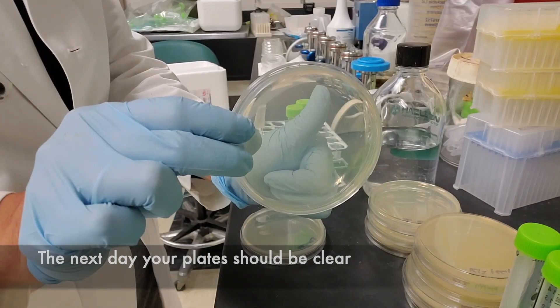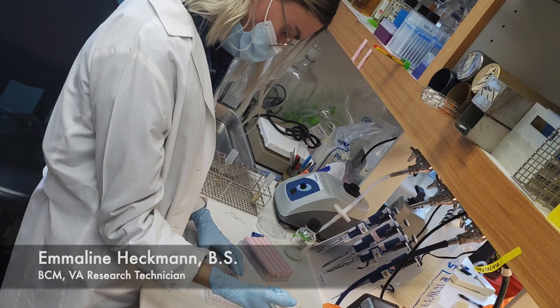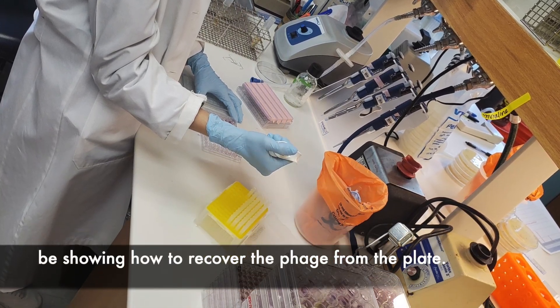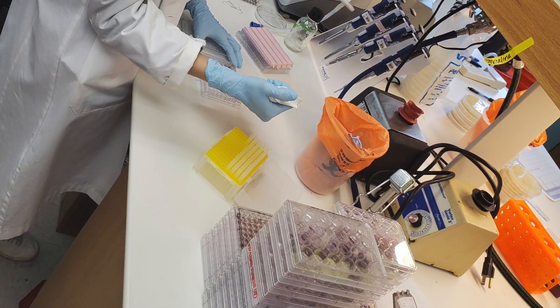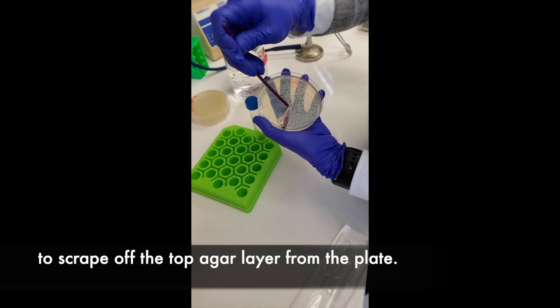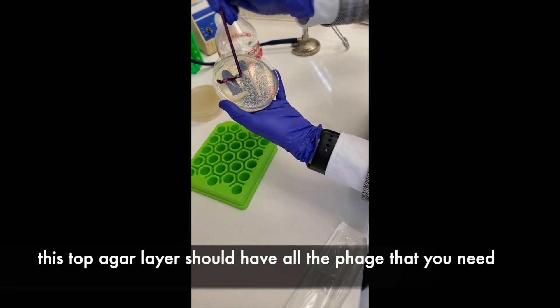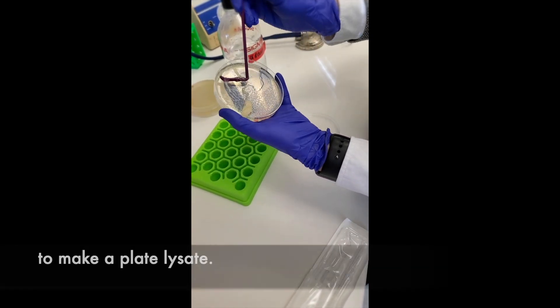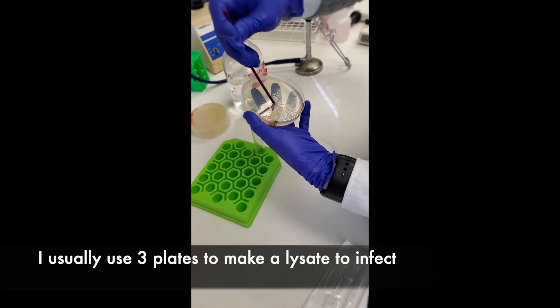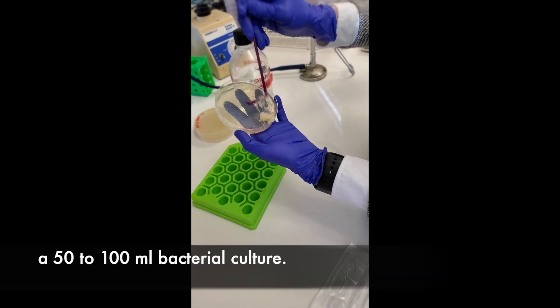The next day your plate should be completely clear, like you didn't even add bacteria. Emeline Heckman is an amazing technician who will be showing us how to recover the phage from the plate. Emeline is using a sterile cell scraper to scrape off the top agar layer. This top agar layer should have all the phage you need to make a plate lysate. I usually use about three plates to make a lysate to infect a 50 to 100 ml culture.